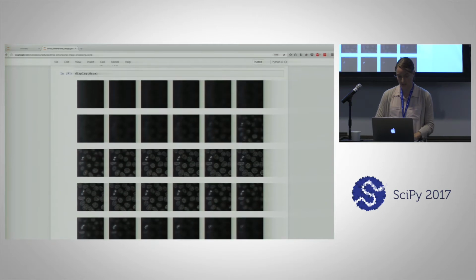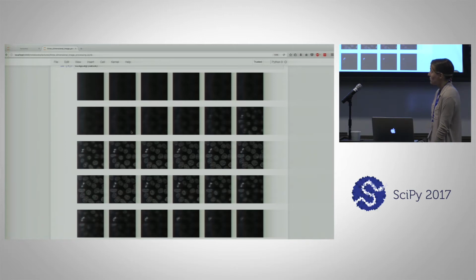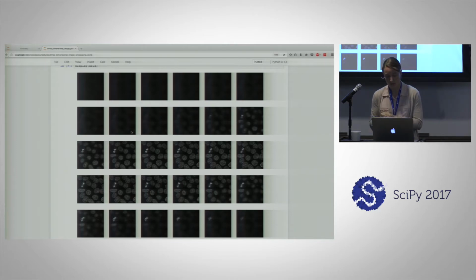So let's take a look. This is our full volume, as the camera sees it, with that top-down view. This is the nuclei channel, the nucleus channel of the image. I've chosen for this tutorial to display the data looking at those image planes because that gives us the most information per slice and also was how the image was captured. You could also iterate left to right or back to front if you wanted to look at those side views.